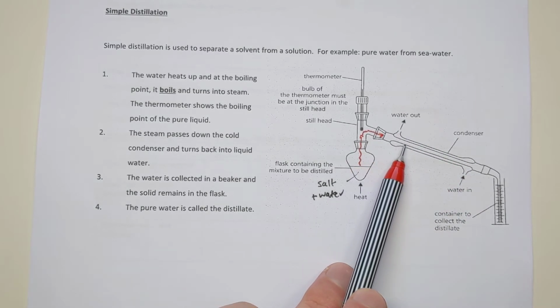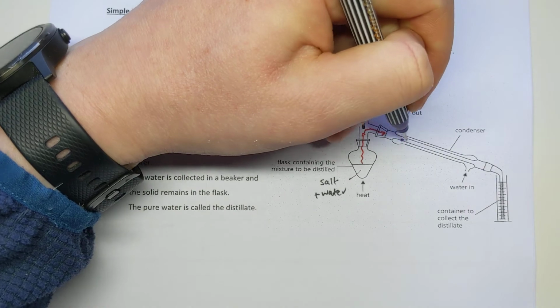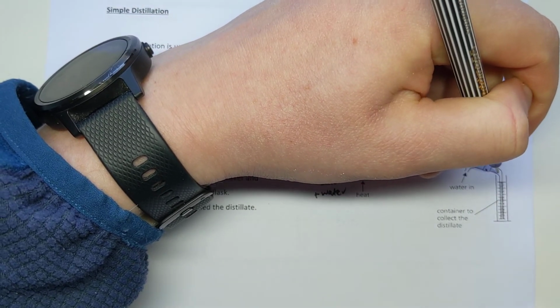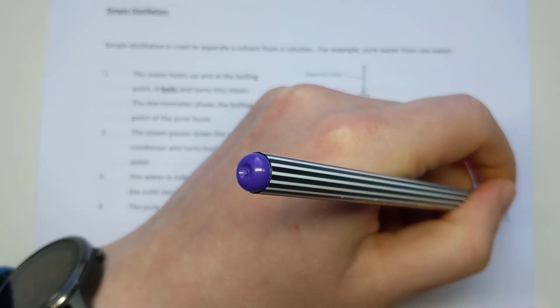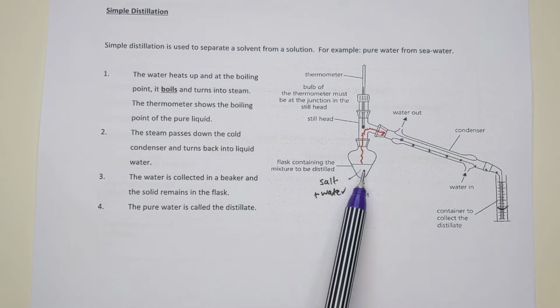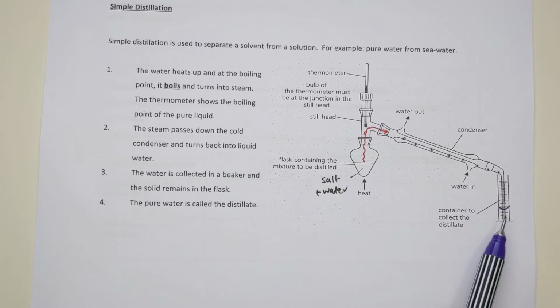When that steam comes into this cool container, it's very quickly going to cool down, and once it cools down, it's going to quickly turn back into the liquid form. Once it's back into liquid form, it's going to drip and run down the inside of the condenser and eventually spill out into this container at the end. So by that process, I've managed to evaporate my liquid off, but keep it by turning it back into liquid in another place. The salt is now here, the water is now here, they're now separated, but I've kept the water.